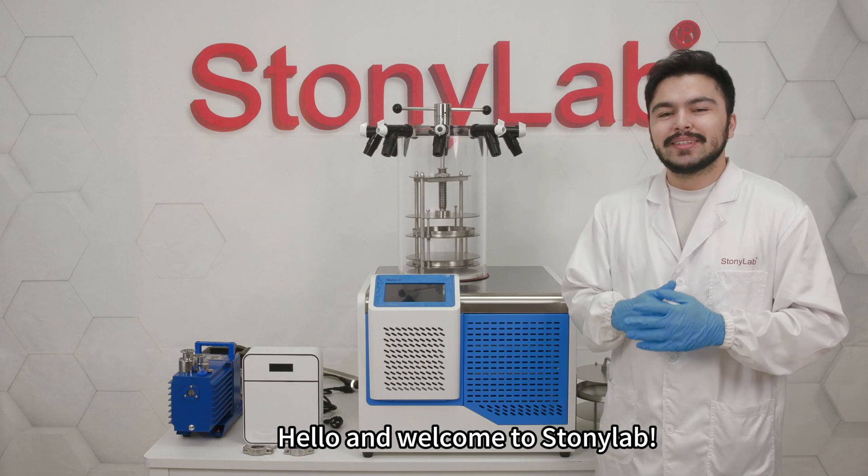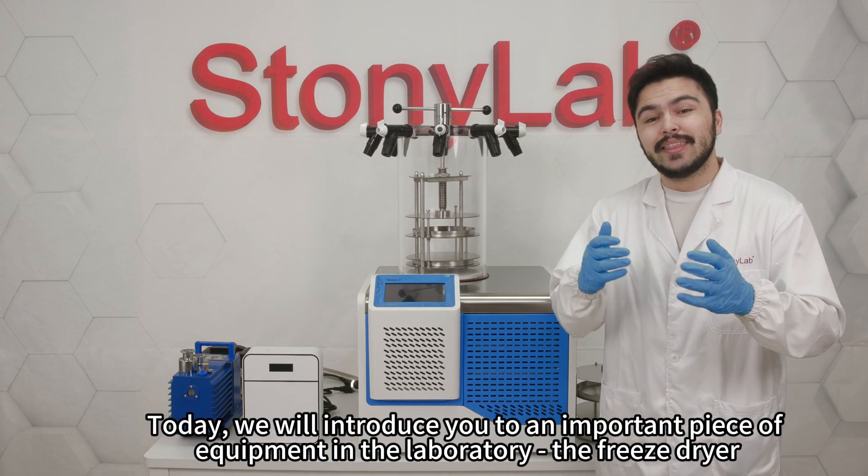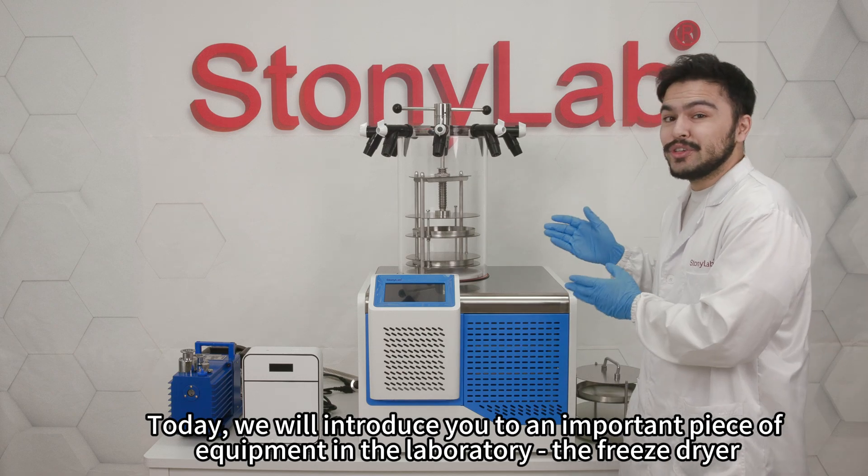Hello and welcome to Stonyalab. Today we'll introduce you to an important piece of equipment in the laboratory: the freeze dryer.